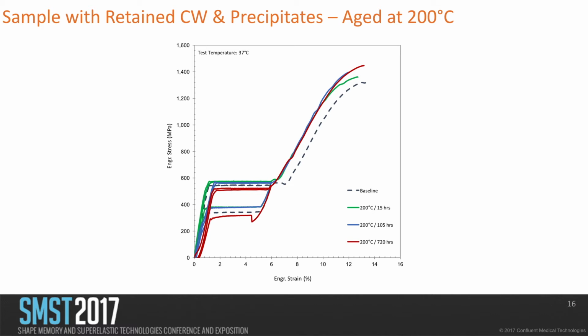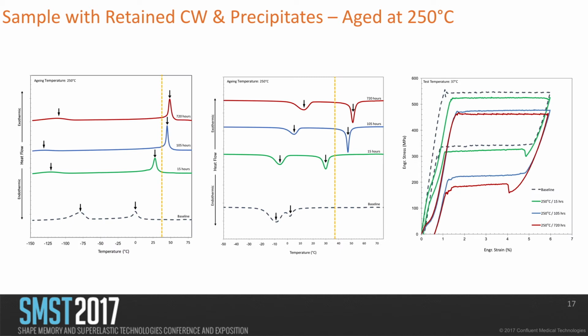Now at 200 C, we also are changing some other properties. Some strengthening is happening in the material as well. And finally, at 250 C, the separation between the two peaks is at maximum. We still have the suppression on Martensite formation.